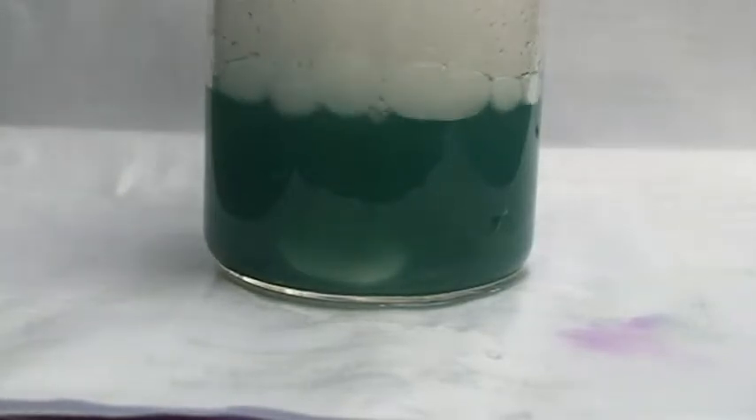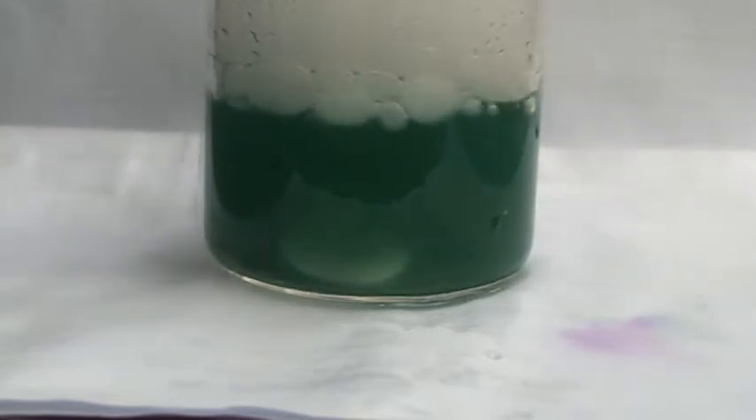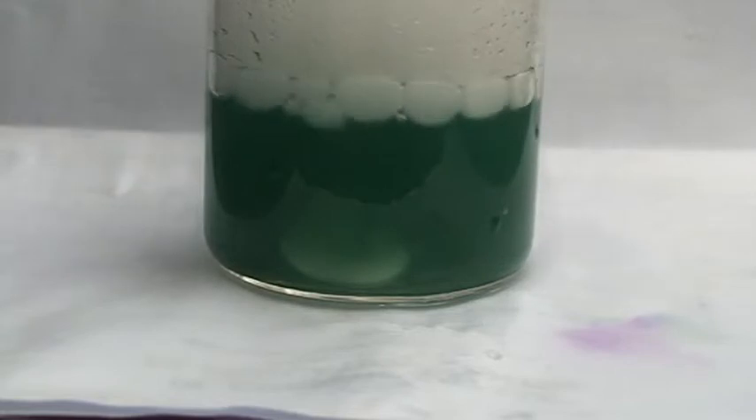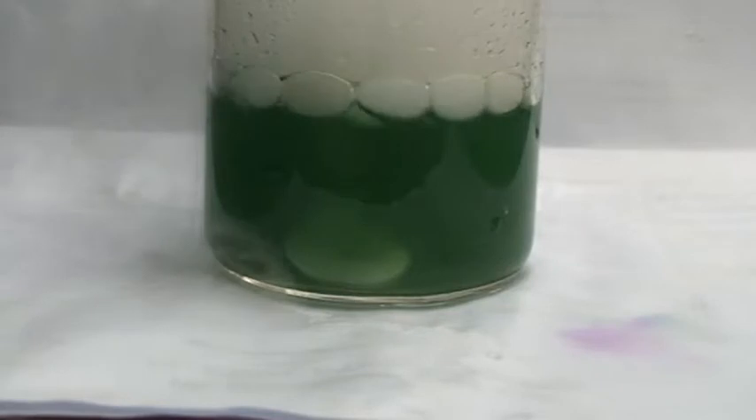As the precipitate begins to disappear, the color changes at the same time. Now it's green. That means all the lime water has disappeared and now you have only water, and in a moment it's going to turn yellow from green.